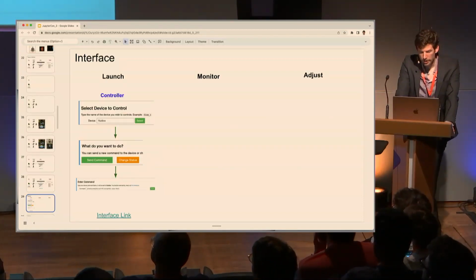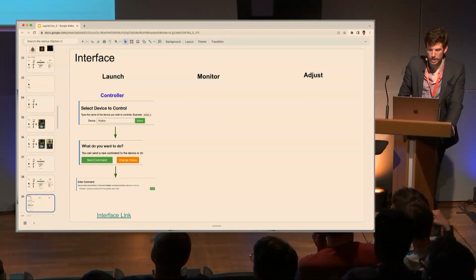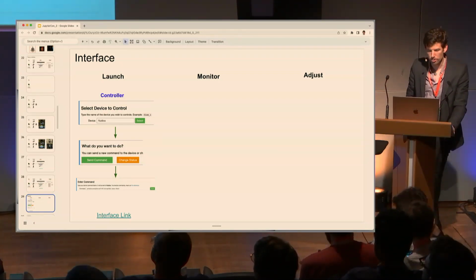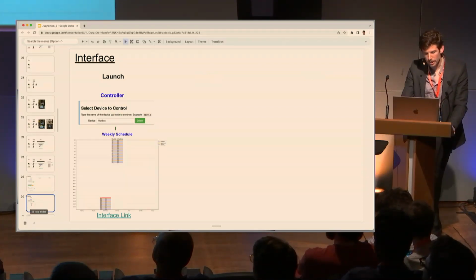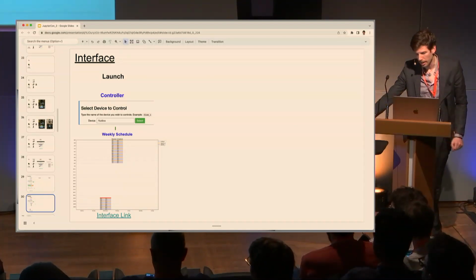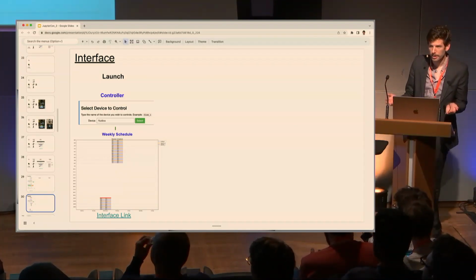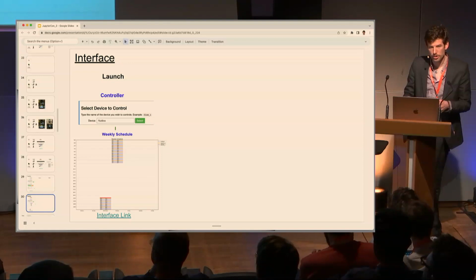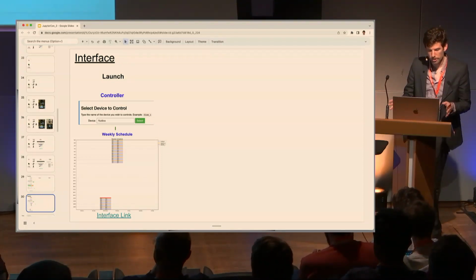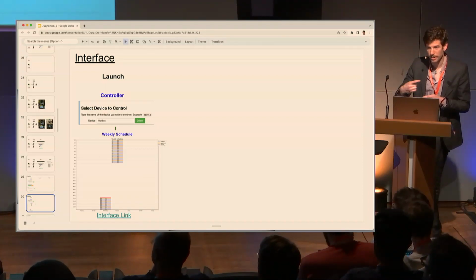So here on the left, you see an example of what it looks like to control a device, where you select a device, you send a command to it. But then the cool thing is you can also kind of schedule commands. So you can say, hey, we run maybe a week, 2 weeks experiments. We do things that long where not a single biologist is touching anything. You just have the experiment run for 2 weeks, and you are collecting data that entire time. And all of it is programmed.